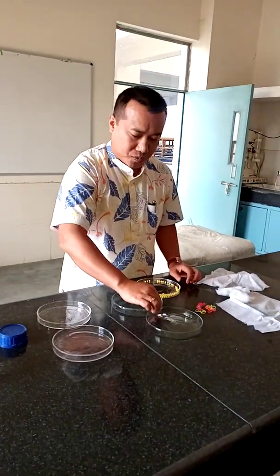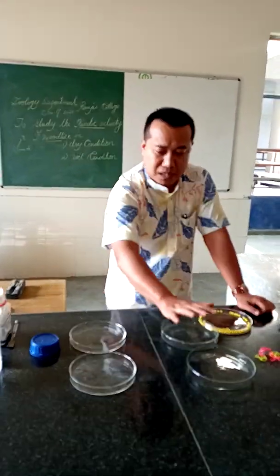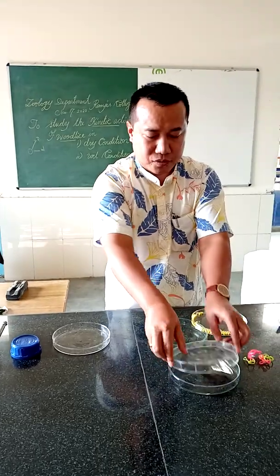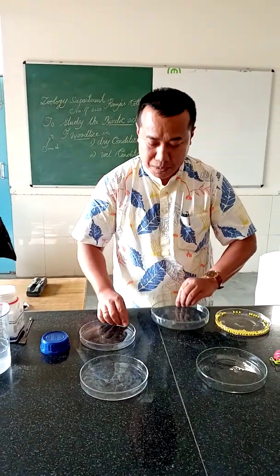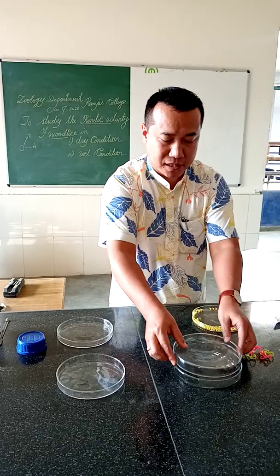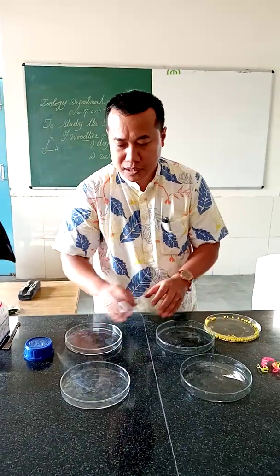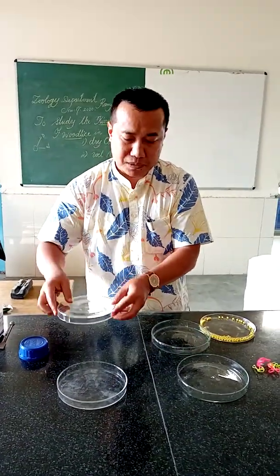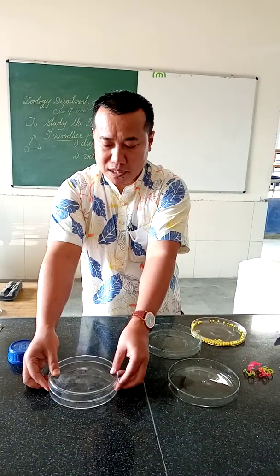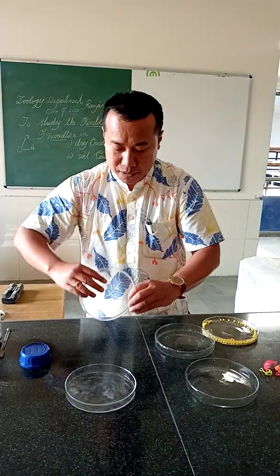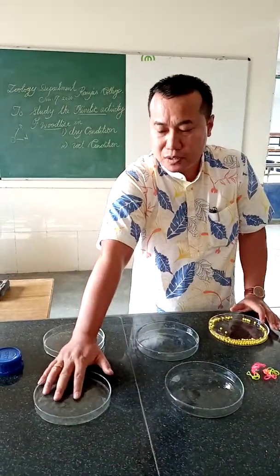We have four petri dishes connected in pairs. The lower portions of one pair of petri dishes — being the same size — will be used together to make one chamber which is dry. The upper covers of the petri dishes of this particular pair don't go inside each other, so we will be keeping those for making the wet chamber. So these are the two environmental conditions we are trying to make.